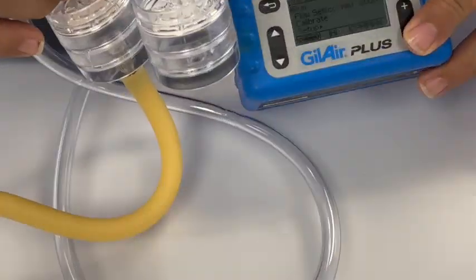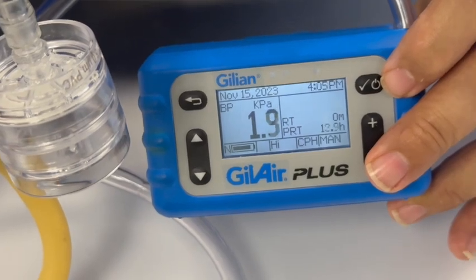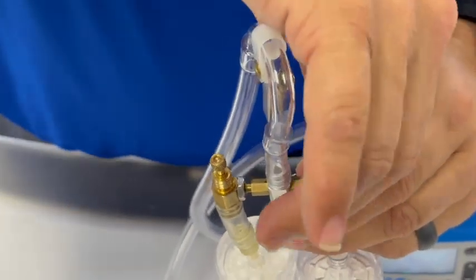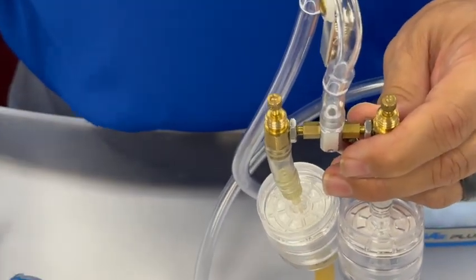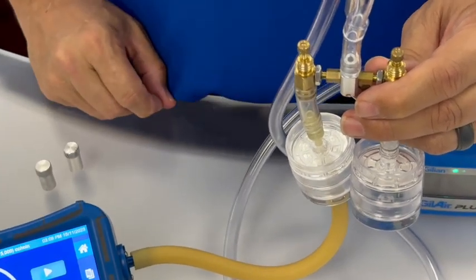Now we will turn on our Gil-Air Plus pump in constant pressure high mode and hit the enter key to start the flow running. We will then remove the caps on the tops of the manifold arms. Set these aside until we finish calibrating the media, at which time we will replace the caps to prevent any changes to the desired flow rates.